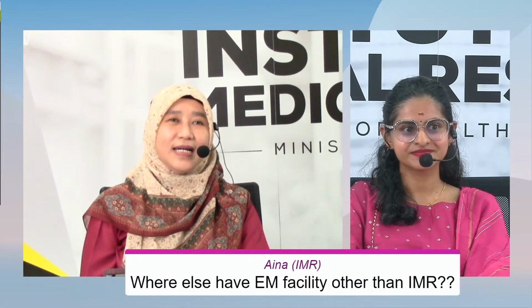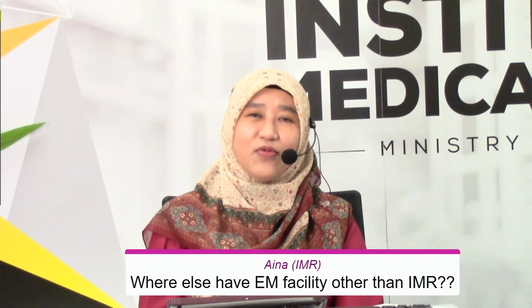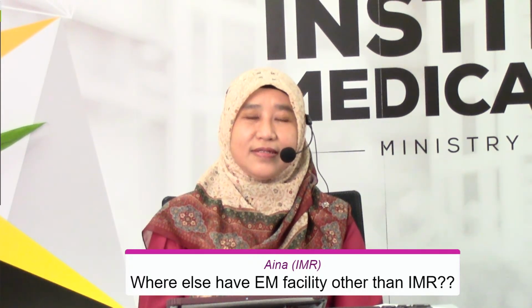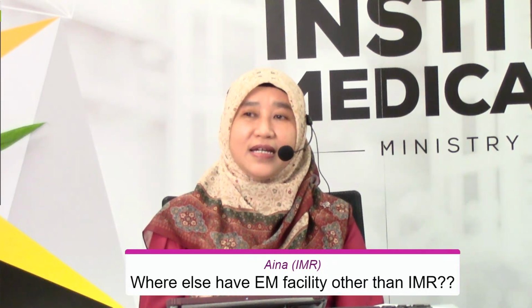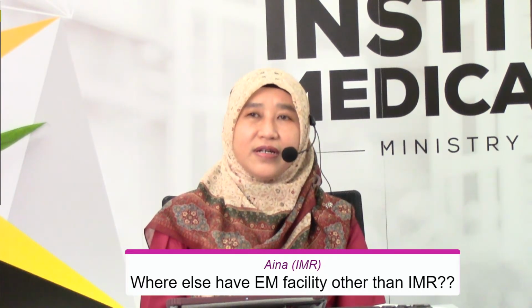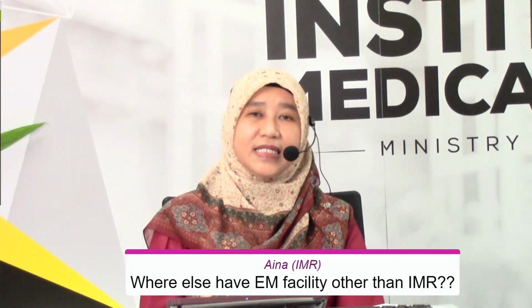Okay, under the Ministry of Health, Makmal Kesihatan Awam Sungai Buloh also has these facilities, but with different objectives and different functions from ours. And most of the public universities such as UPM and UKM also have these facilities. Thank you.